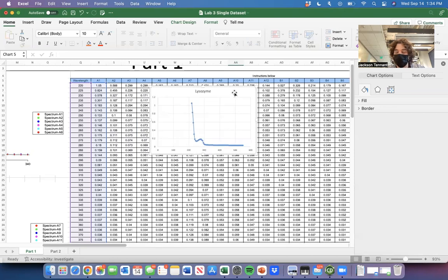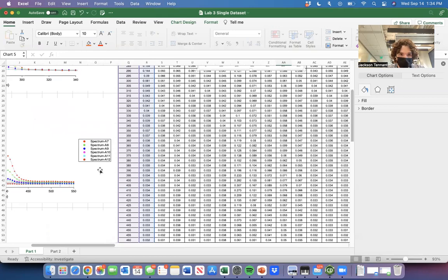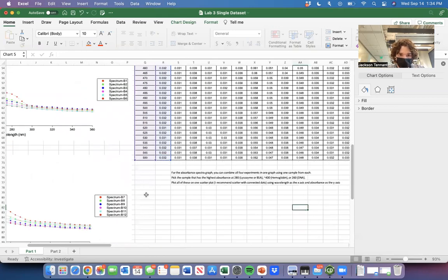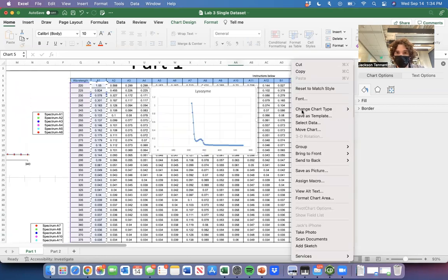Now, great. I just need to do the same thing three more times with the rest of these. So remember, this top performer was A7. This one was B1. And this is B7. So I'm going to be using those. I'm going to do it one more time, and you're going to do the other two.